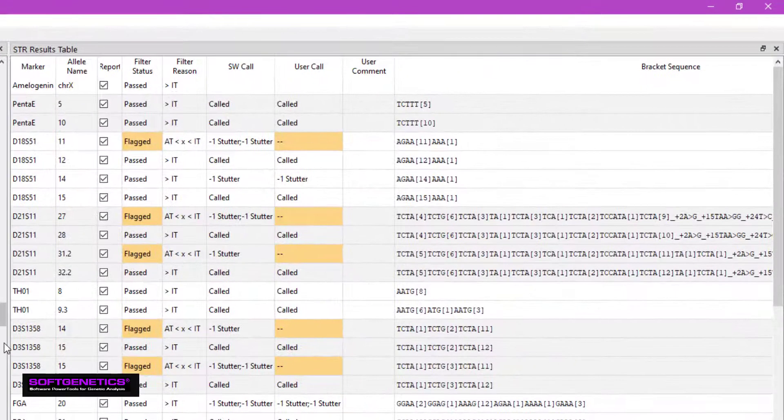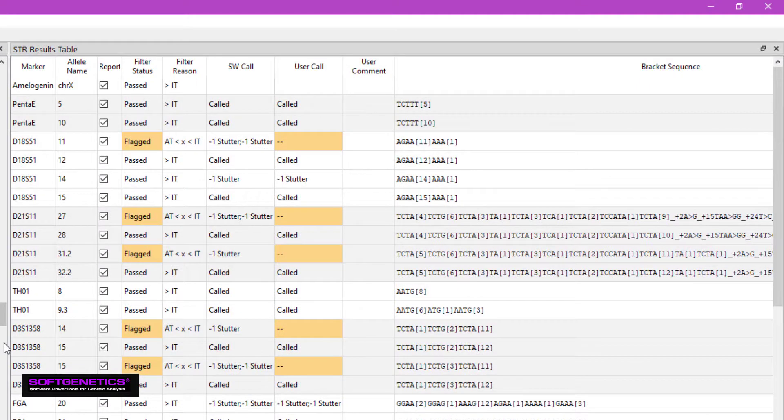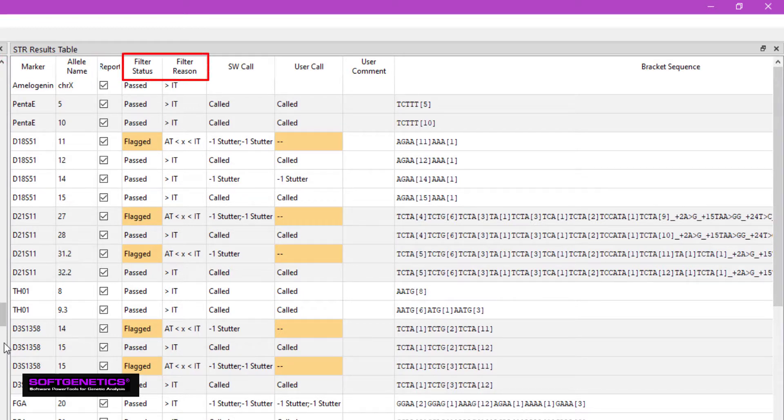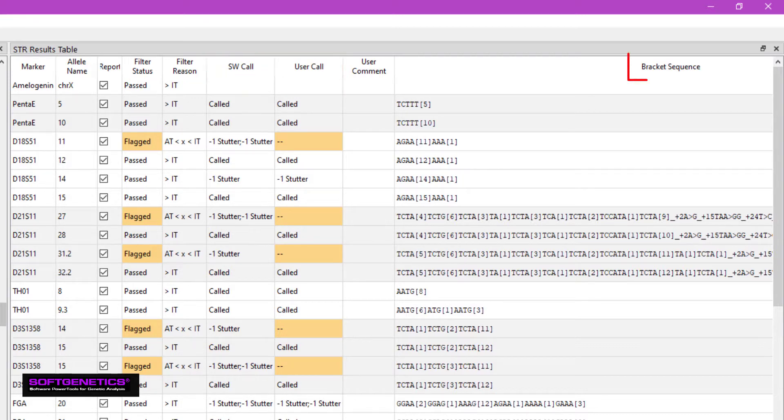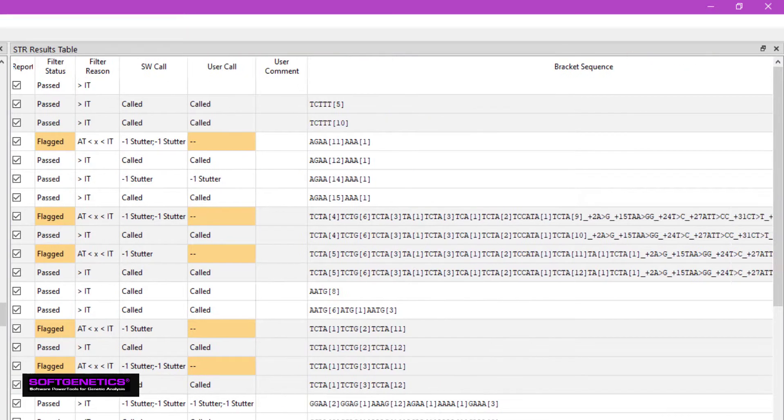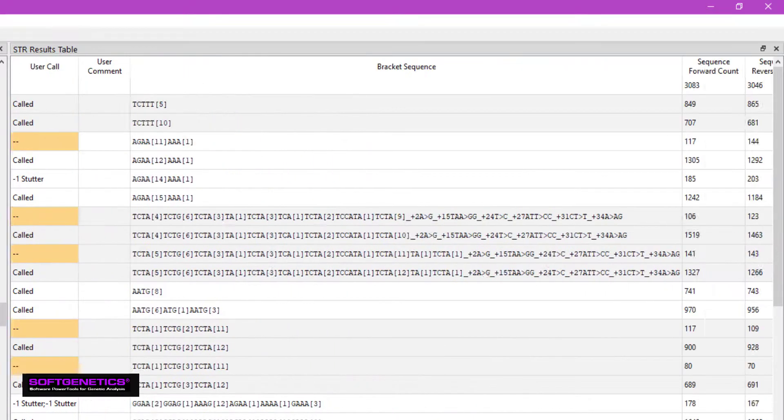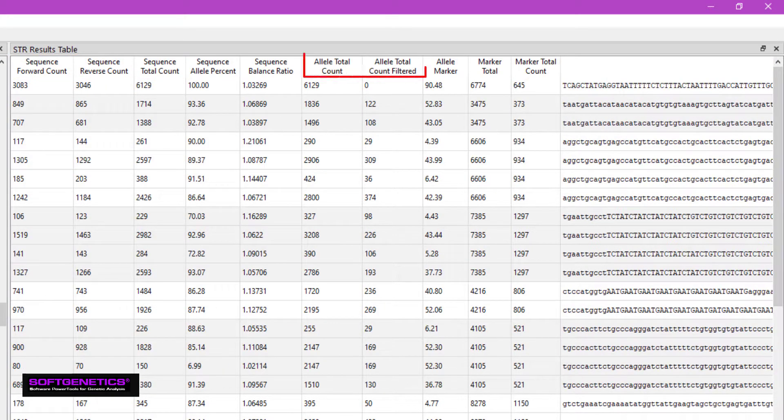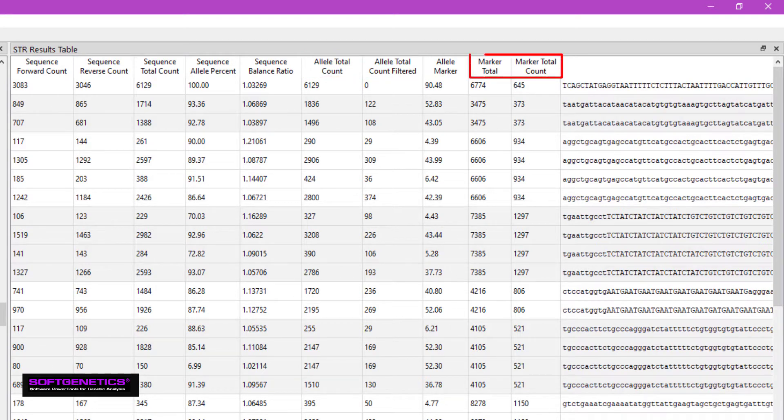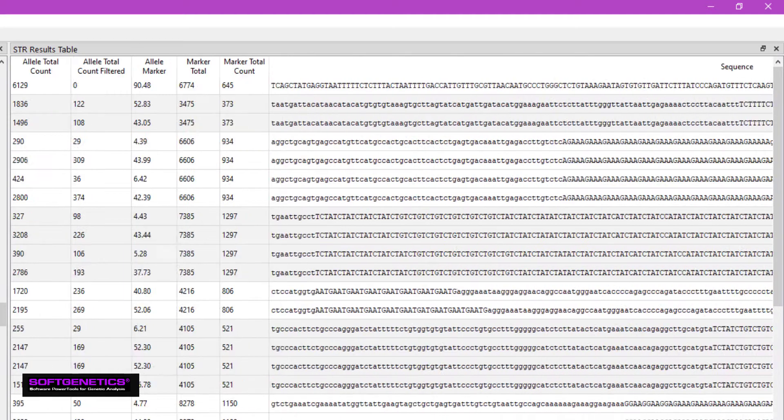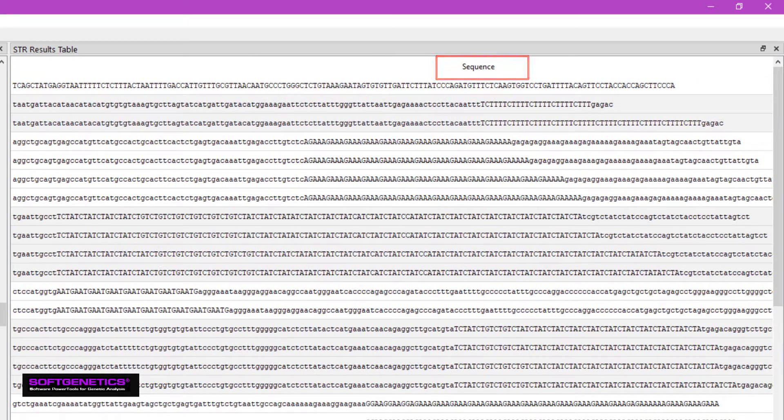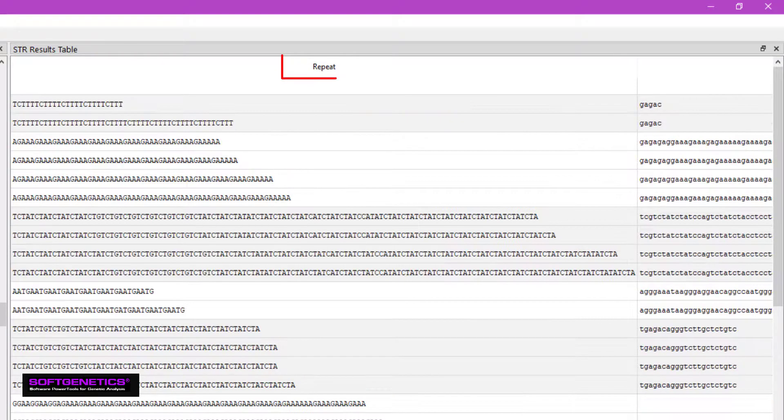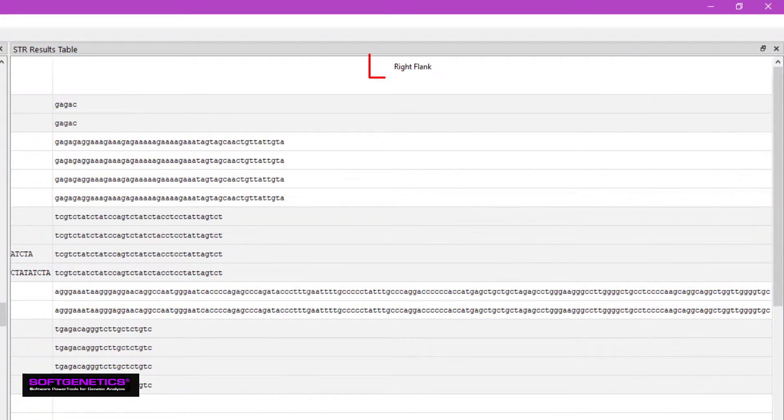On the right is the STR results table that includes columns for the marker and allele names, an option to add individual sequences to the report, filter information, calls, fragment sequences in a bracket format, forward and reverse read counts, allele counts, marker counts, the full sequence, and the sequences for the left flank, repeat region, and right flank.